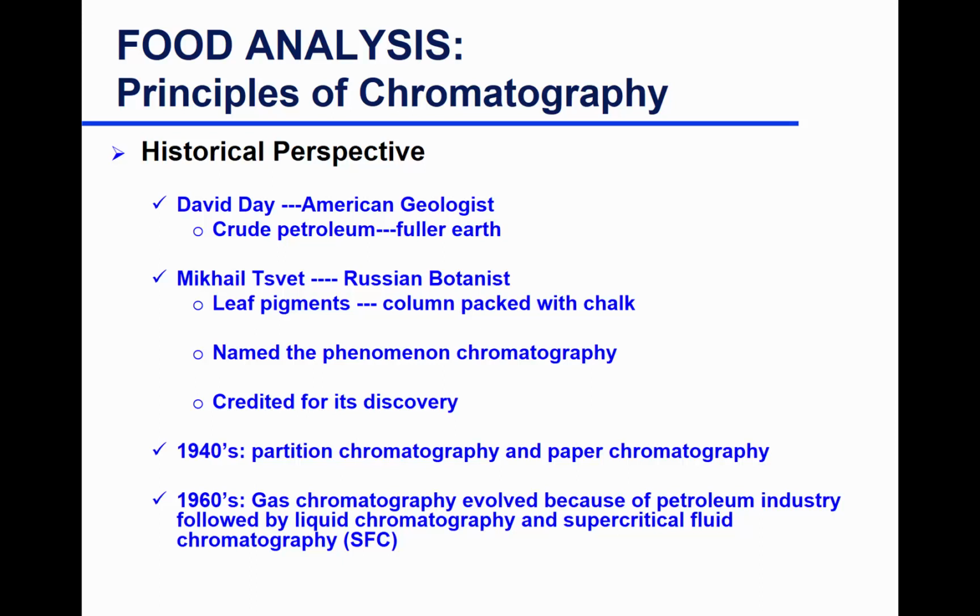So the principles of the discovery were given to Tswett, the first one that used a packed column, actually with chalk, and ran leaf pigments through, and they separated into different colors.